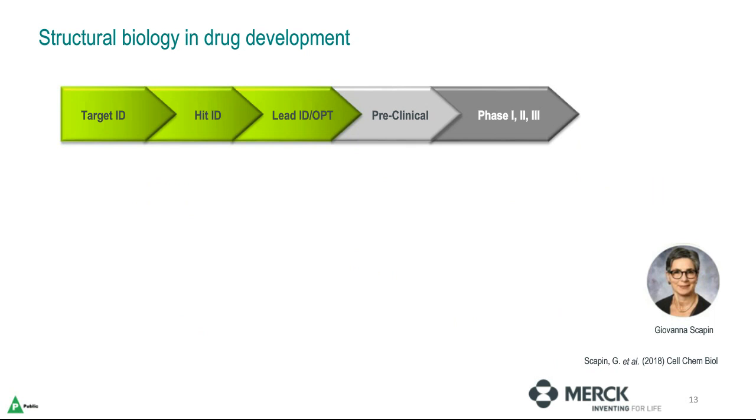But coming back to drug discovery, this figure represents the different stages in the development of a drug in which cryo-EM can be involved from a structural point of view, before the stages of preclinical and clinical trials. The figure has been extracted from a paper published by my colleague, Giovanna Scapin, whom I will mention a few times during this talk because of her contribution to structure-based drug discovery and her research on the insulin receptor by cryo-EM.